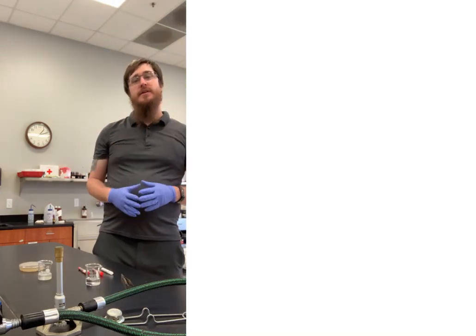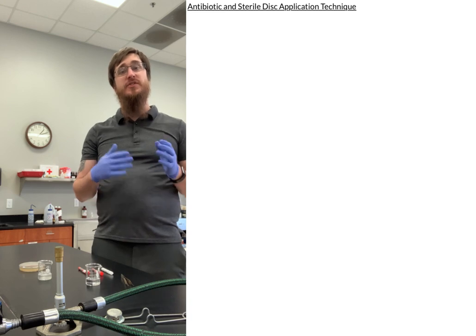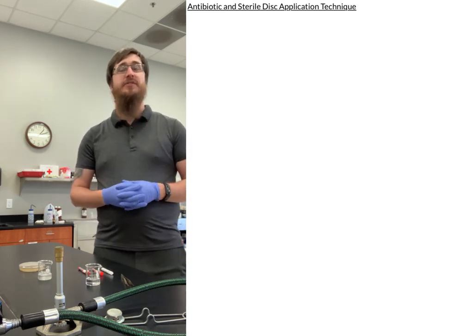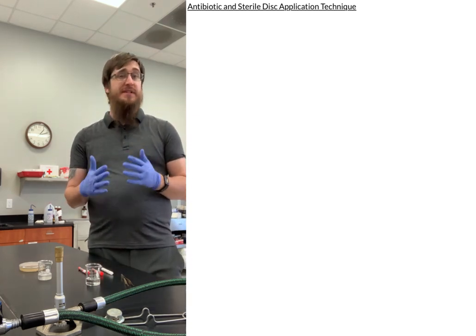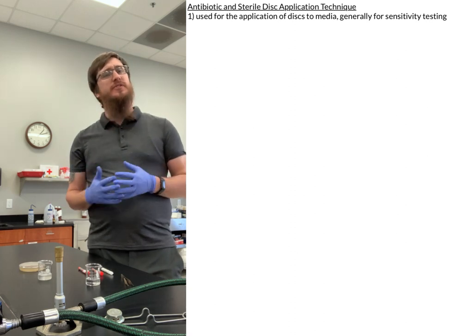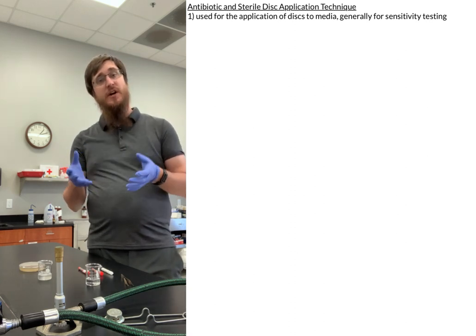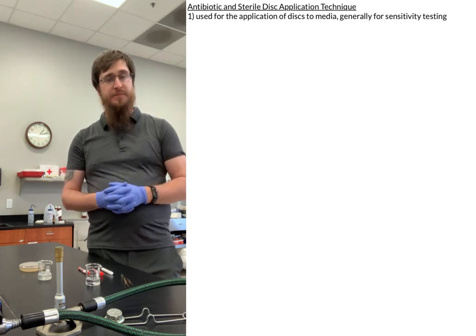Hey everybody! Today we're going to be talking about our antibiotic disc and sterile disc application techniques that we're going to be using in our class. And these techniques are really just used for the application of discs onto media, generally for what we call sensitivity testing, which is a concept that we'll talk more about later on in the semester.